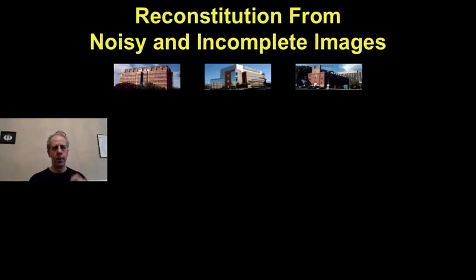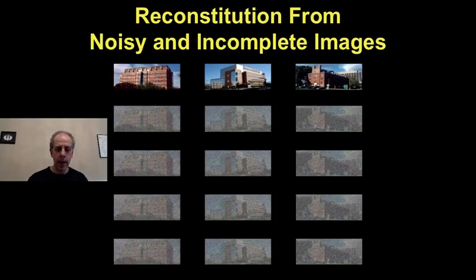So here is the problem. Let me illustrate that to you. Let's say that we have 3 scenes, as we see here. 1, 2, 3. Now let's simulate cryo-electron tomography for this. We basically get multiple copies of each one. That's a good part.